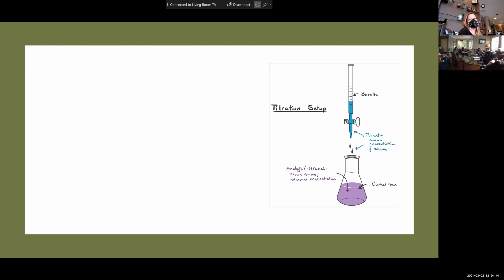So that's why I was like, today if you get this on you, it's a little different than last week. It's 10 times worse. Yeah, it's a little more of a rush to the sink to rinse it if you don't have your gloves on. So then what we put in that burette is our standard solution.